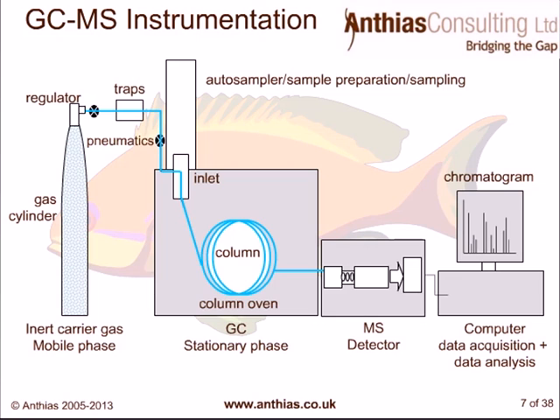So for example, I do a lot of GC×GC, and when I first started doing that in 2001, I did quite a bit of looking at different purities of carrier gas to see what it really improved in my results. And I ended up using a purity of helium of 6.0, which actually reduced a lot of the noise in the baseline when I was using GC×GC. So especially if you've got a very sensitive instrument, it could really affect it.